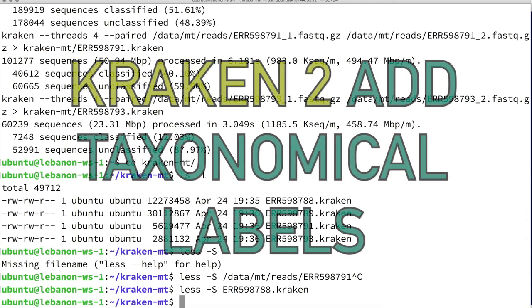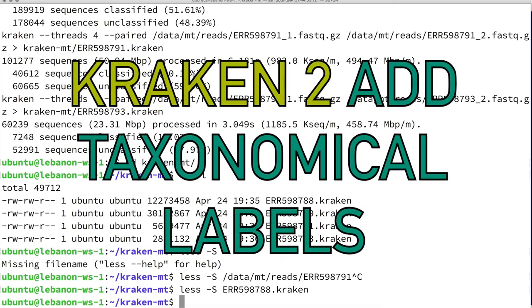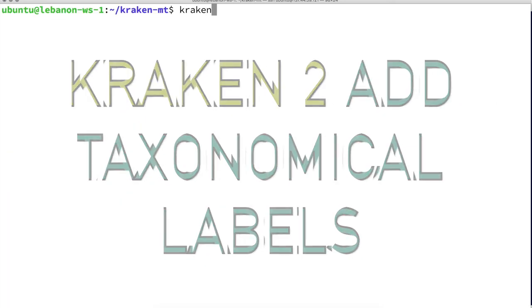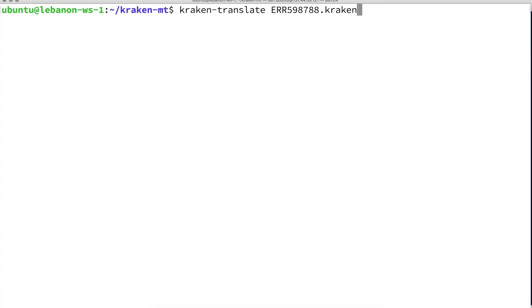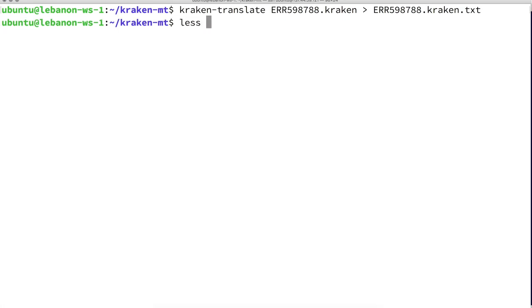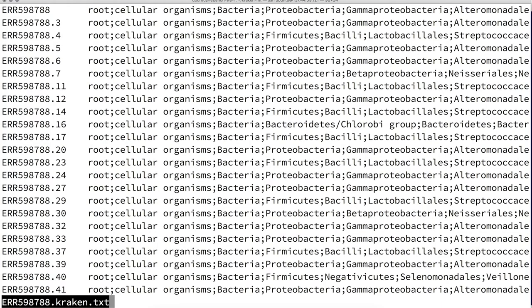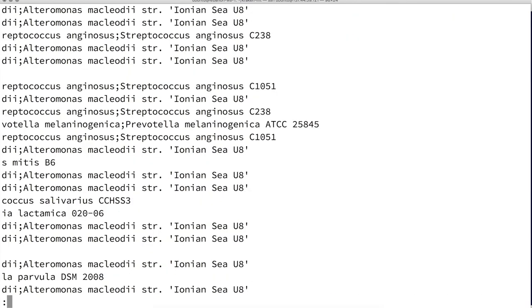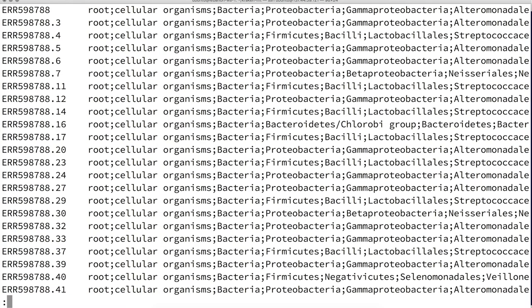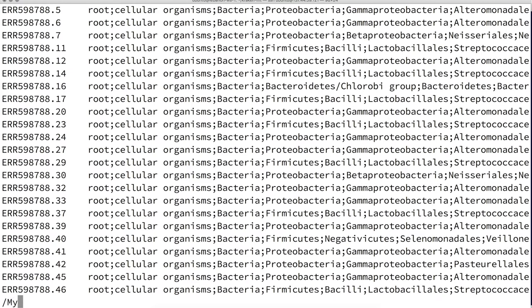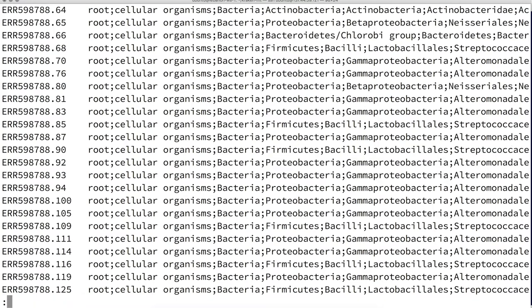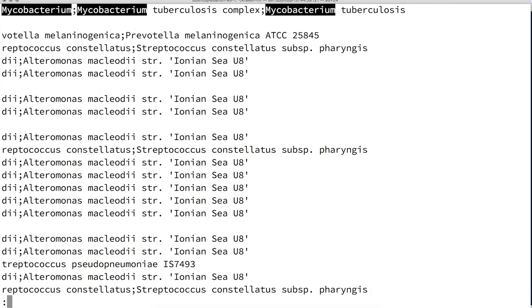If we want to see a read-by-read classification — which, again, is not something we usually do — we can use the kraken-translate program. It takes as input the output of Kraken and adds nice human-readable labels. I'll add a .txt extension to the output file. Looking at the created file, we now see that for each read we have the full taxonomy classification. Using less, we can search for mycobacterium — and yes, found: Mycobacterium tuberculosis.